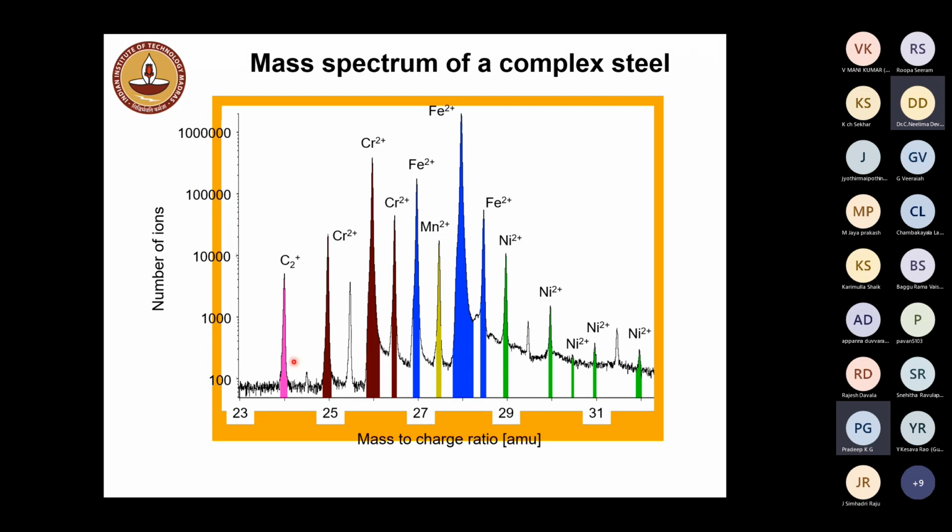And now isotopically resolve element by element. That means every element in the periodic table has its own isotopic abundances. As you see in this particular image, iron, for example, has 4 different isotopes with different natural abundances. Similarly, chromium has 4, carbon has 2, and hydrogen has 3. So every element in the periodic table has its own isotopic abundances. Now, whenever you see a peak, the relative intensity variation of the peak represents the typical isotopic abundance variation.